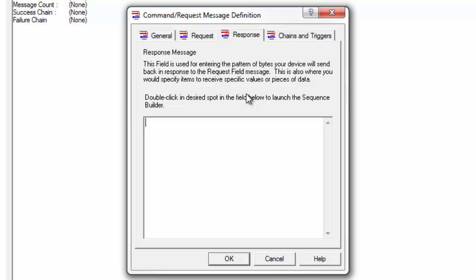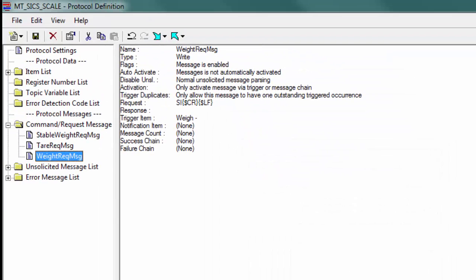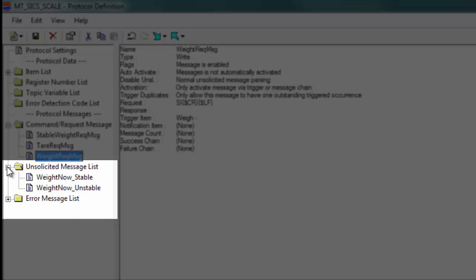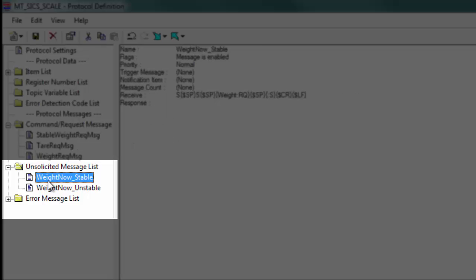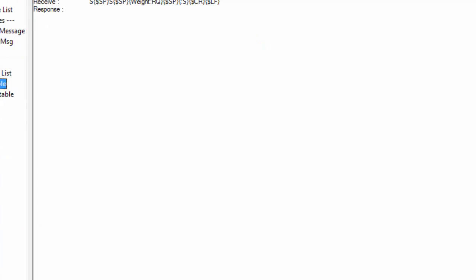We have our command followed by our carriage return and line feed. With this particular command, since we can expect more than one possible response back, we leave the response space blank. What we're actually doing is using two different unsolicited messages to handle the different possible responses from the device — we have one configured for the stable weight format that we saw.